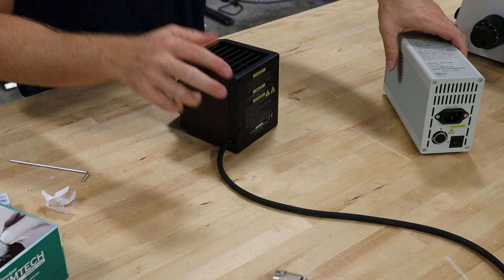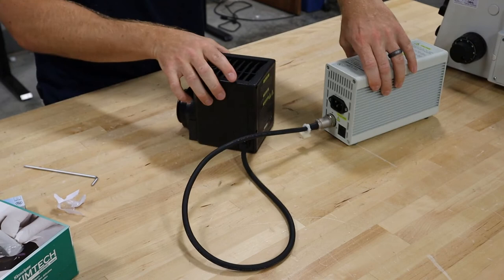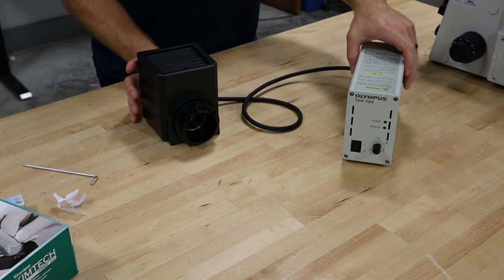Before you put it back on the microscope, I always like to plug it in, turn the system on, make sure it works, and then reassemble it to the microscope. It would just be the reverse of how we disassembled it or took it off.